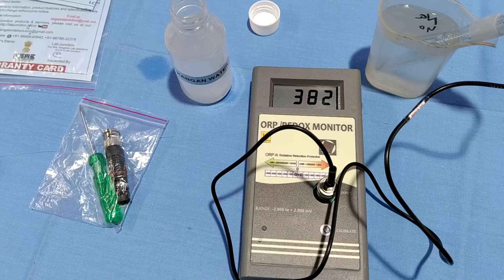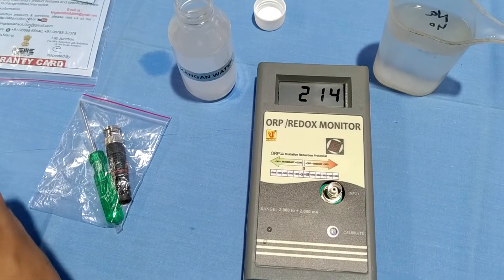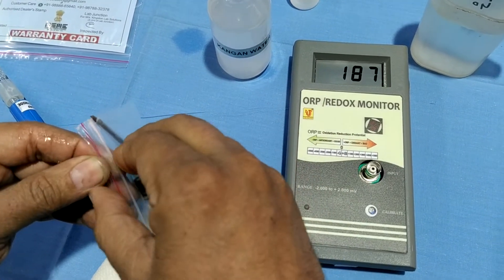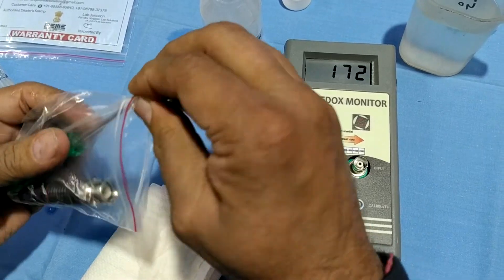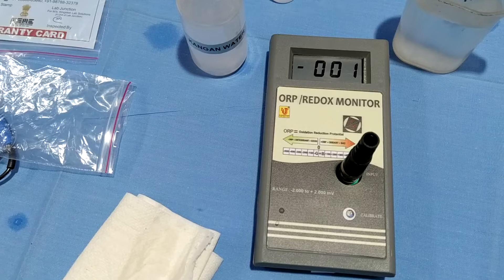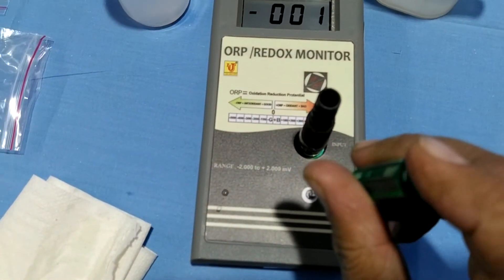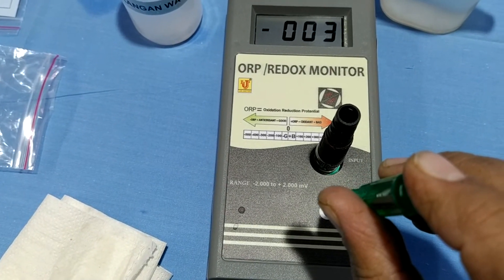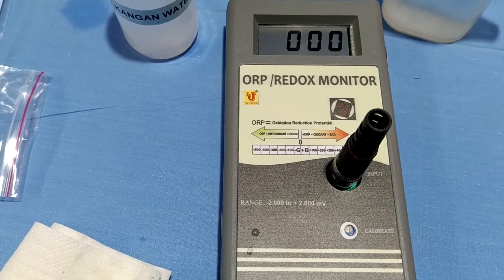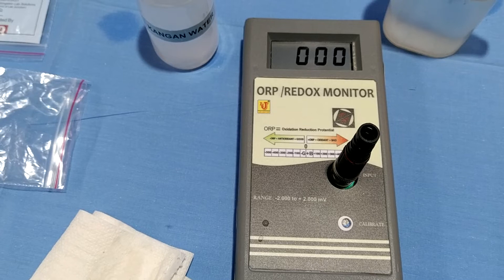How do we calibrate this? If you want to calibrate this ORP Redox Monitor, take the screwdriver adapter and fit it directly, then check for zero. If it does not show zero, set it using the screwdriver like this. This is now calibrated. Please calibrate using the adapter of the ORP Redox Monitor.